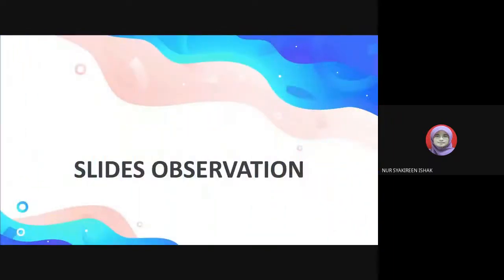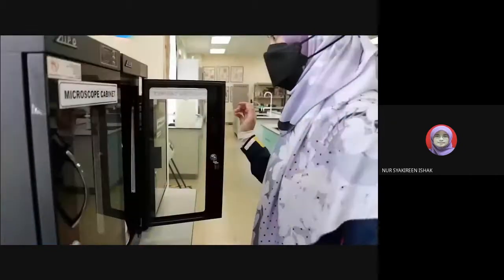Now, let's continue with slide observation. You will learn the right way to use a microscope. So, make sure to give 100% attention to the demonstration. We will use the plant cell as an example. Microscopes usually are stored in a dry cabinet.